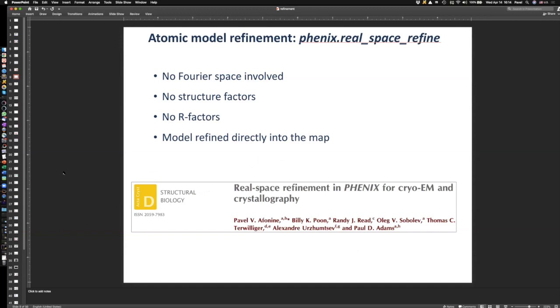There's a paper published about two years ago that describes all the nuances of real-space refinement. What's important to realize is that at no point in the procedure do we use Fourier space. There are no structure factors involved, no R-factors, and the model is refined directly into the map. That's the important thing to realize about real-space refinement in Phoenix.